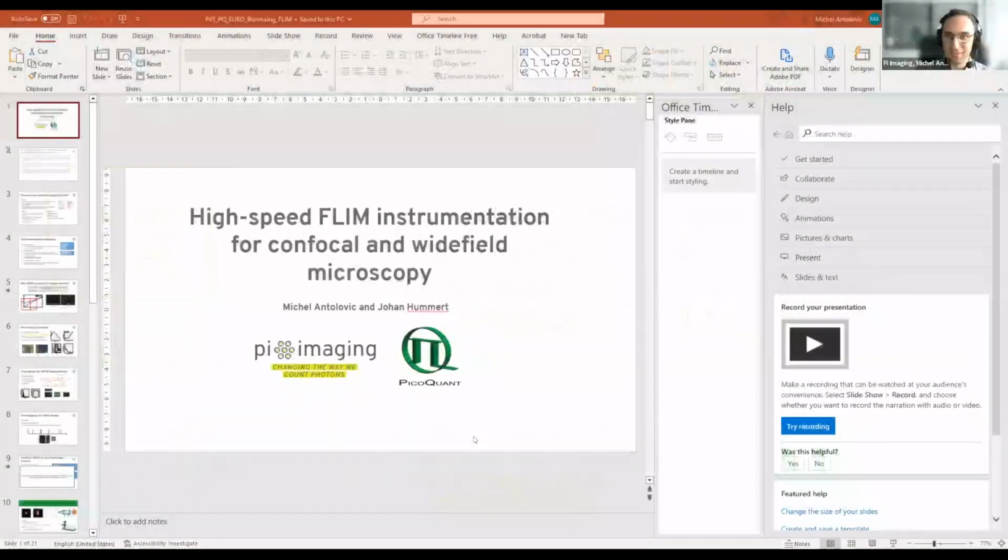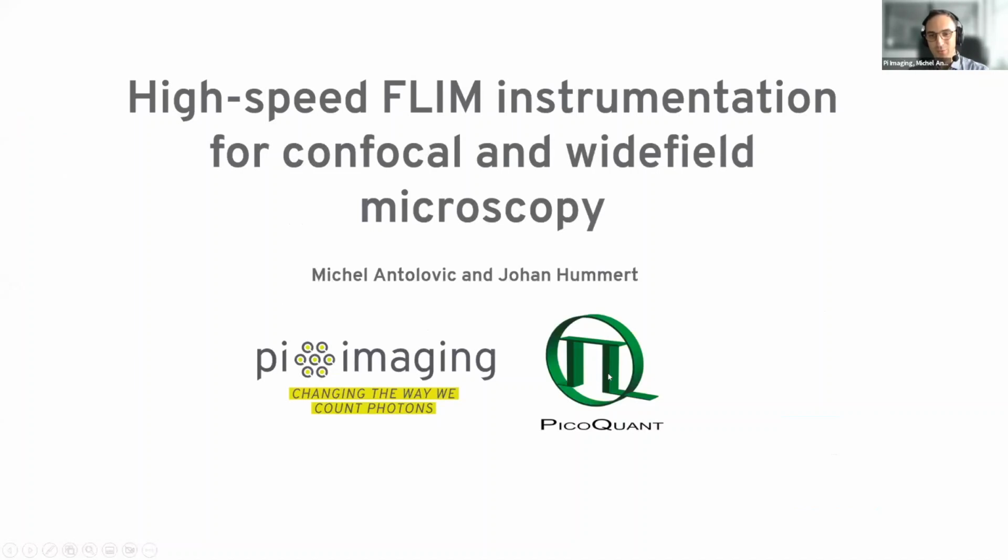I think this is an excellent introduction to what we want to present today and the collaboration that we are having ongoing. We are specifically focusing on FLIM as the application with the main target to increase the speed. And very importantly, we are enabling both confocal and widefield FLIM.